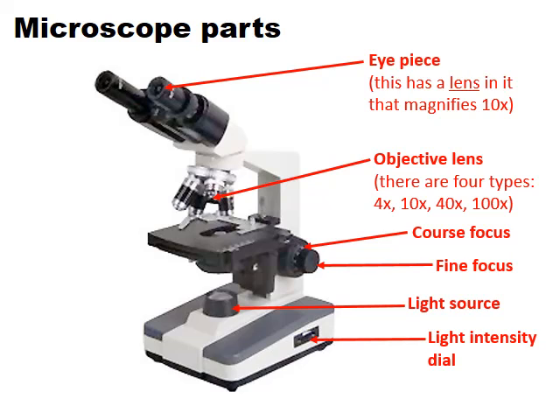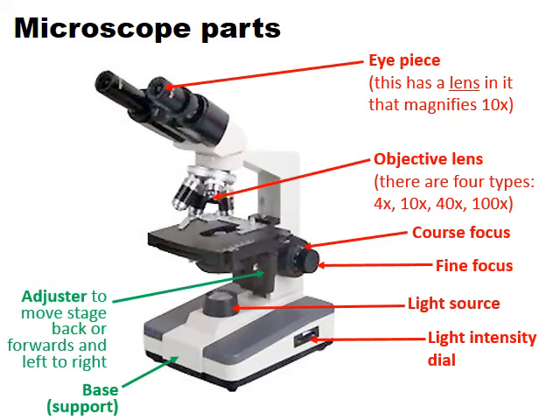Underneath the stage is the light source, and we can modify the intensity using the light dial on the side. This is a light microscope, so light shines through the sample, then passes up the objective lens, up the microscope, and through the eyepiece lens into your eye. There's a base at the bottom to support the microscope, and another adjuster in front of the coarse and fine focus that allows us to move the stage back and forth or left to right.